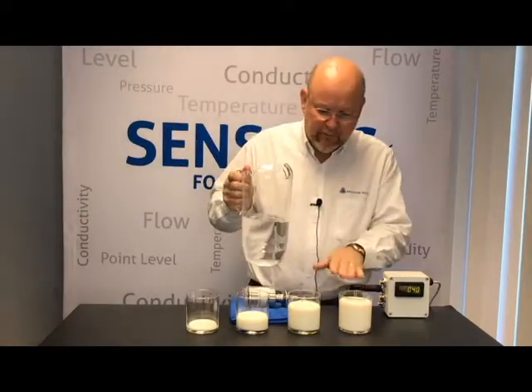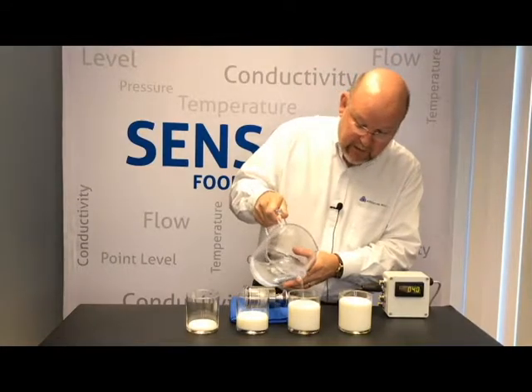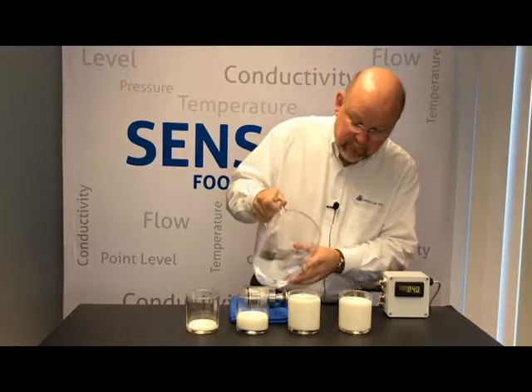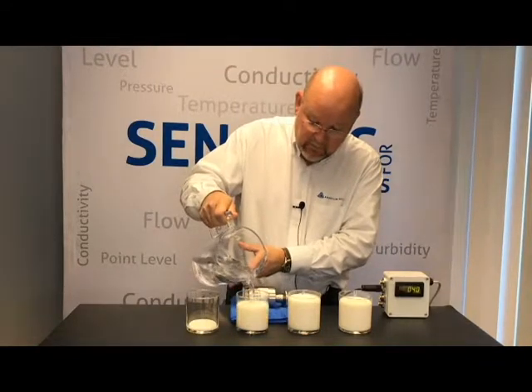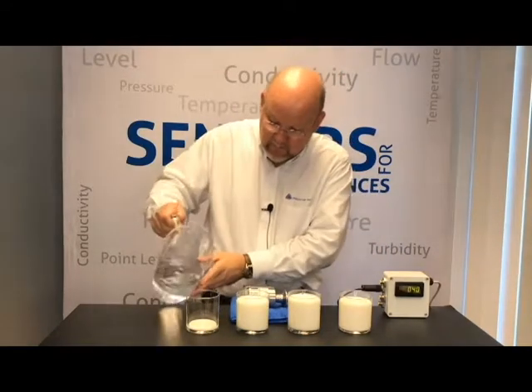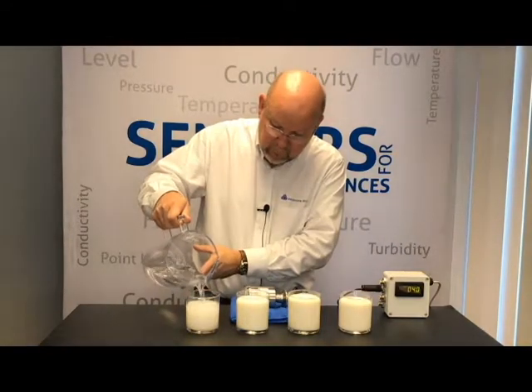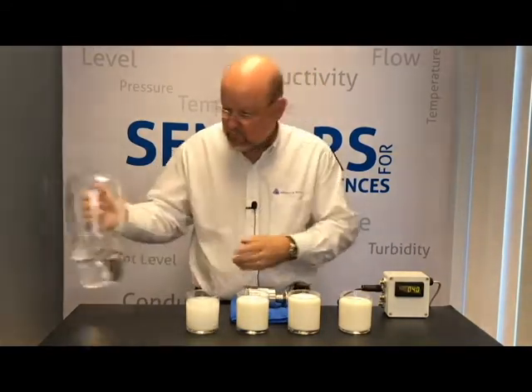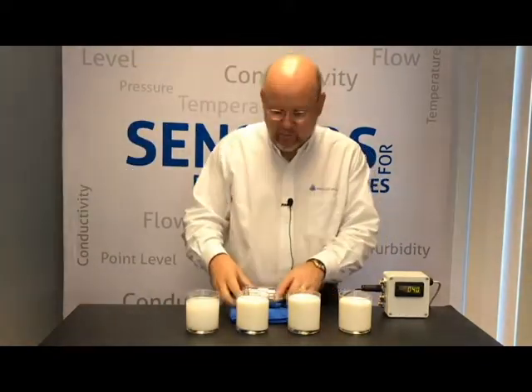Next, I'll take my water. Obviously, I'm not going to add anything to that because we're going to want to measure full product. But I'm going to top this one up. I've got my concentrations of liquid set.